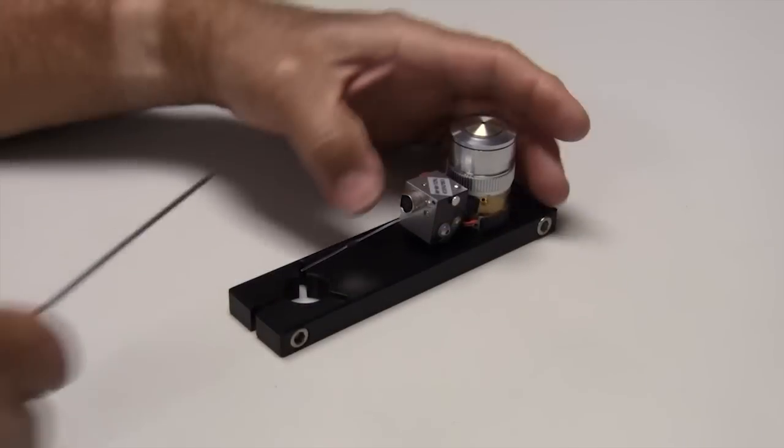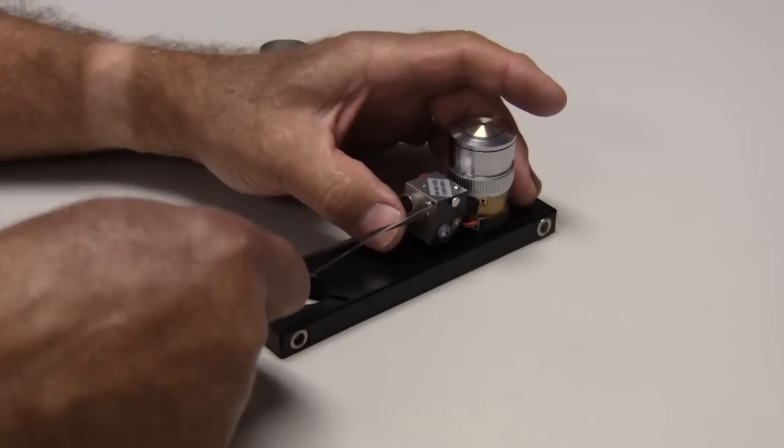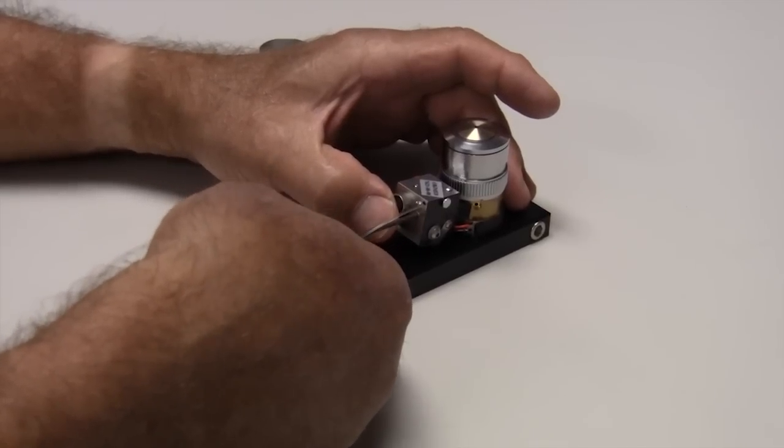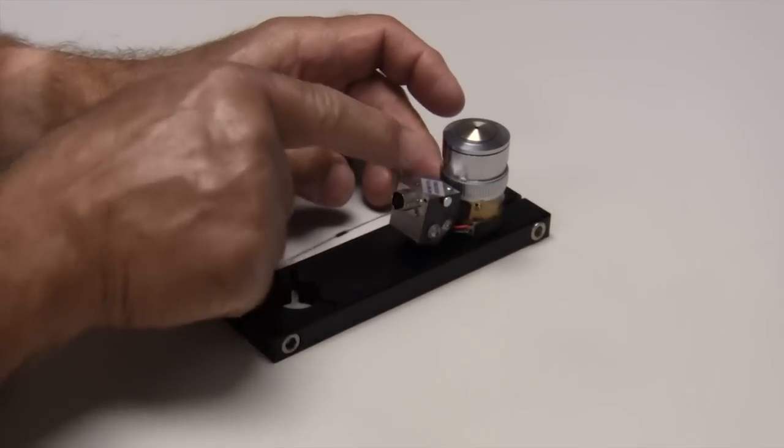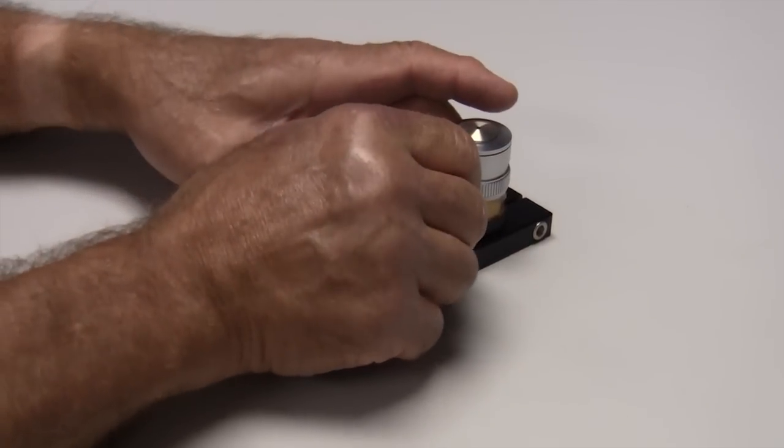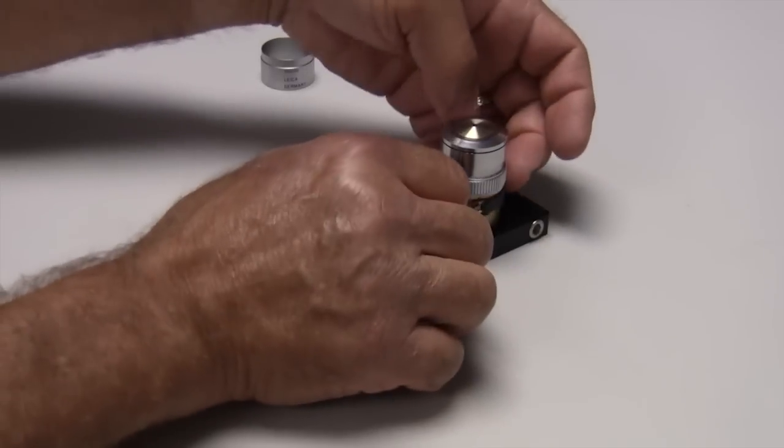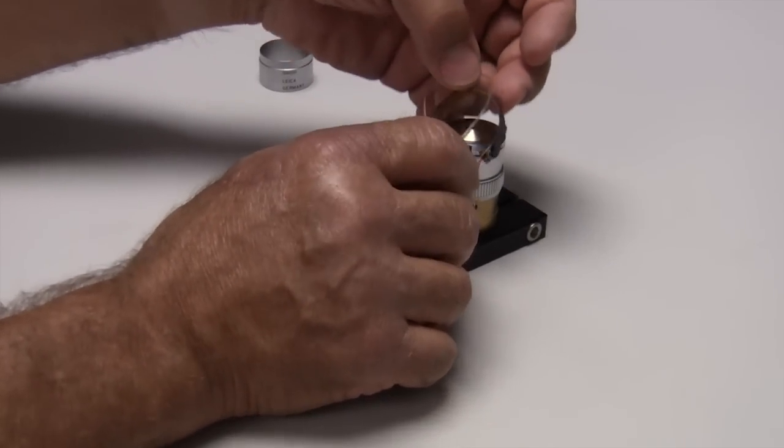To remove the bioptics objective heater, you repeat the procedure in reverse. Simply loosen the screw on the back of the objective heater to loosen the band, press the little button on the side here and pull out a little bit. That expands this little wire, and then lift the whole assembly off of the objective.